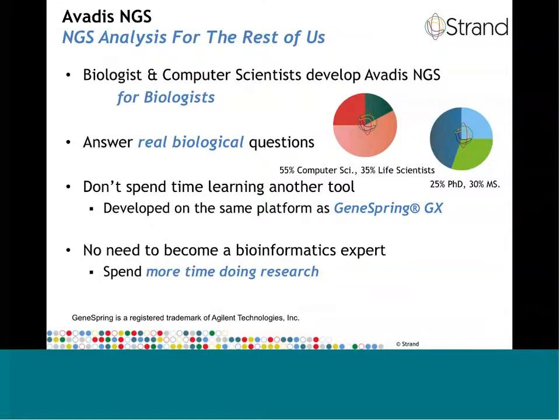For those of you that are current GeneSpring users, you will be happy to know that some of the NGS functionality that is currently offered by Avadis NGS will be integrated into the GeneSpring platform in the coming year. This will allow you to perform both array and NGS-based analysis in the same package and compare and contrast the results from different and orthogonal technologies, thereby further enhancing your research.